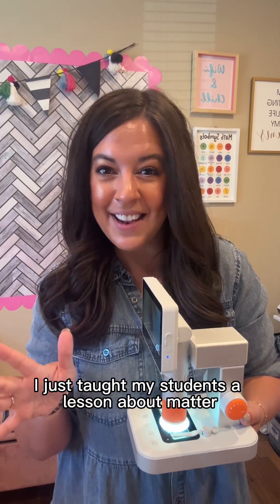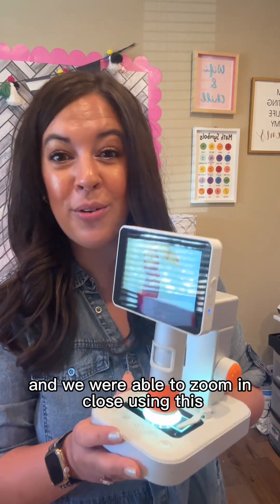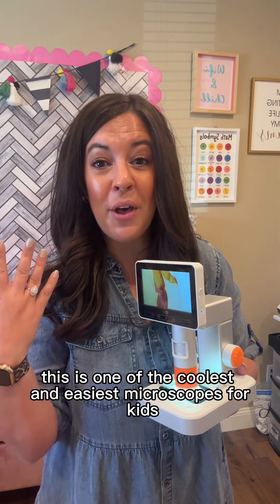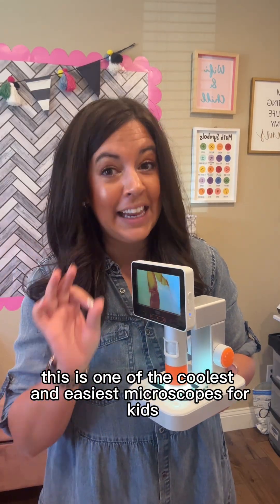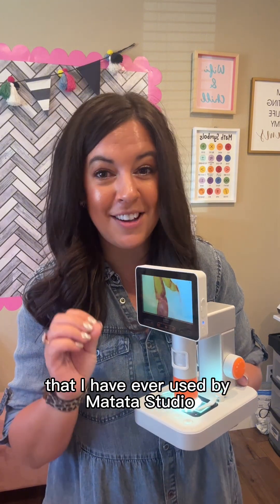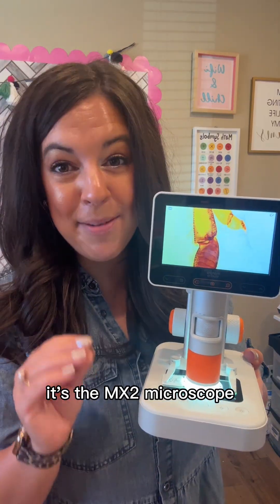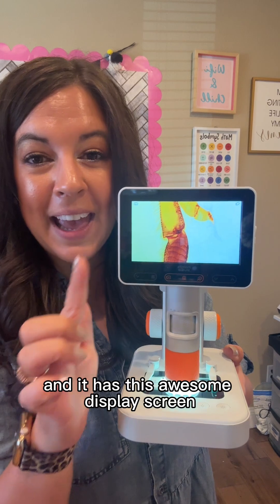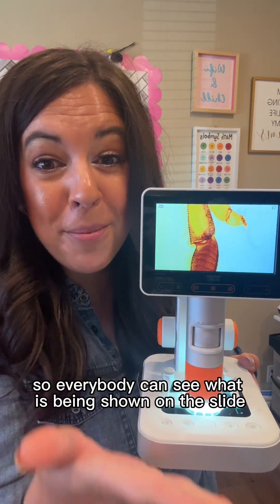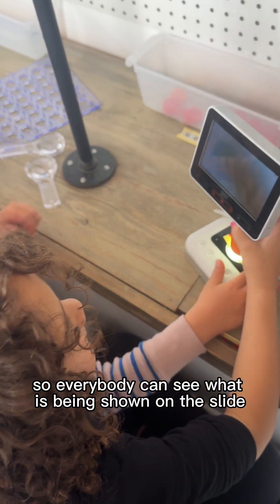I just taught my students a lesson about matter and we were able to zoom in close using this. This is one of the coolest and easiest microscopes for kids that I have ever used, by Matata Studio. It's the MX2 microscope and it has this awesome display screen so everybody can see what is being shown on the slide.